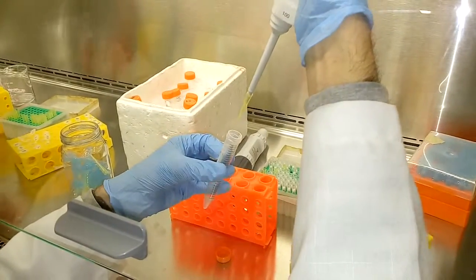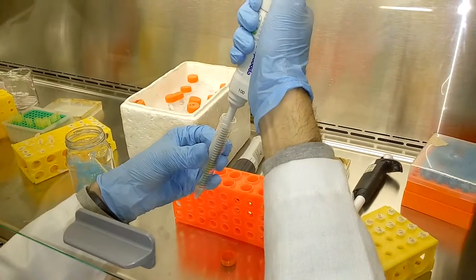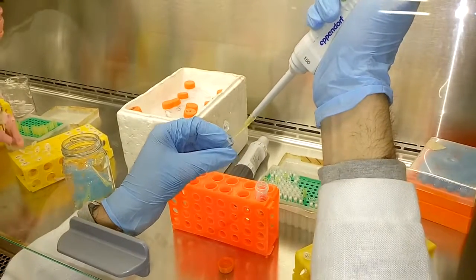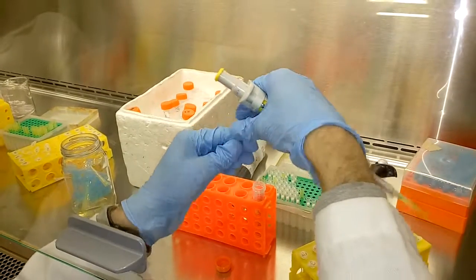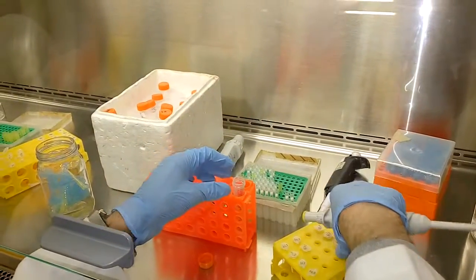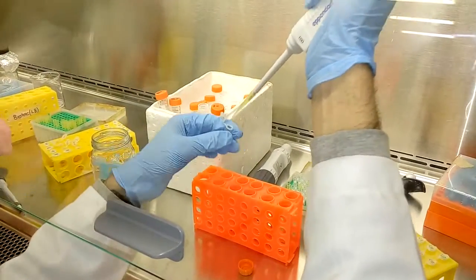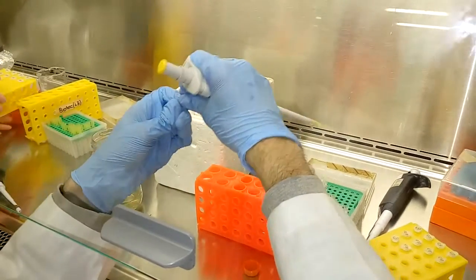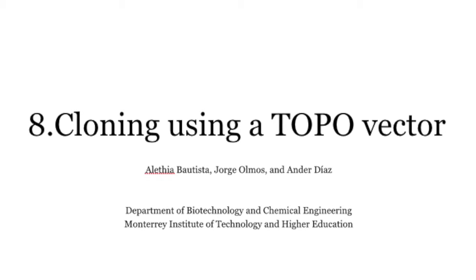They are necessary when cloning genomic DNA or complementary DNA. The galK genotype, which is a galactokinase mutation for blocking catabolism of galactose. And finally, the F' genotype, which is a self-transmissible low-copy plasmid used for the generation of single-stranded DNA when infected with M13 phage. As expected, the efficiency of this ligation was not very high, but still acceptable.